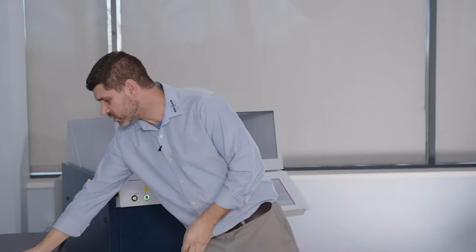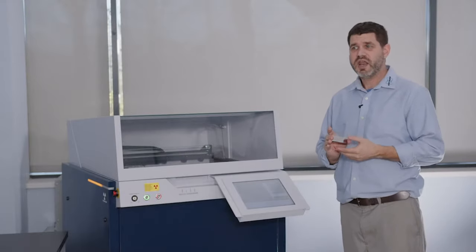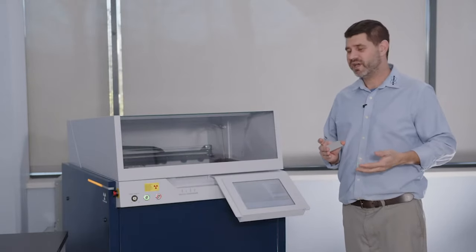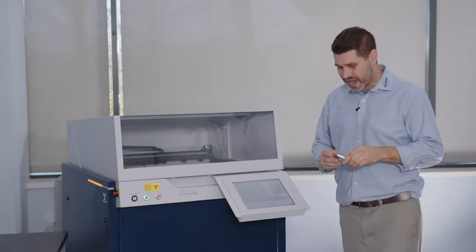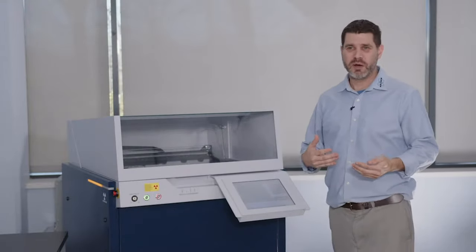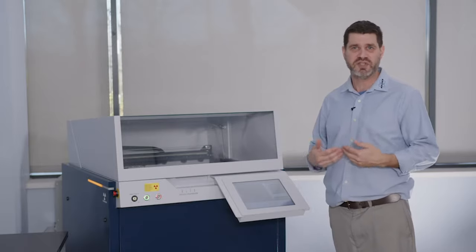Then we also talked about the crystals, where we can add up to 8 crystals in this unit. Now, why would we want to add another crystal? Like I mentioned earlier, better resolution, more intensity. We have crystals that allow us to look at elements from oxygen all the way up to americium. Those are like the three standard crystals that come with every system.